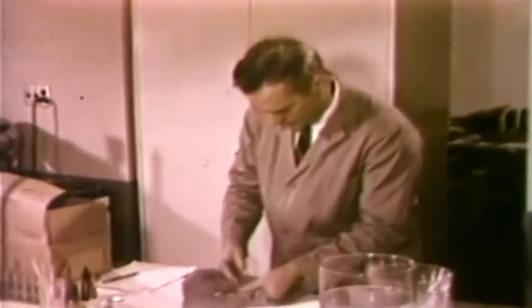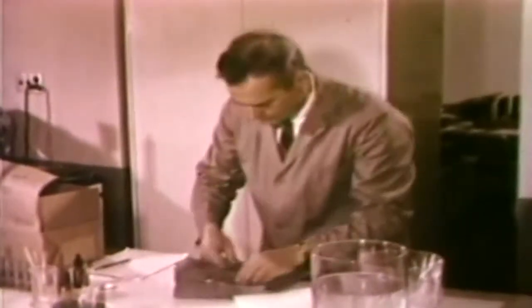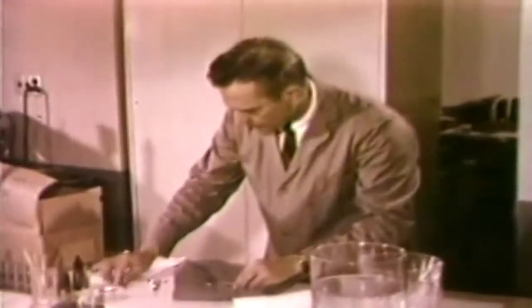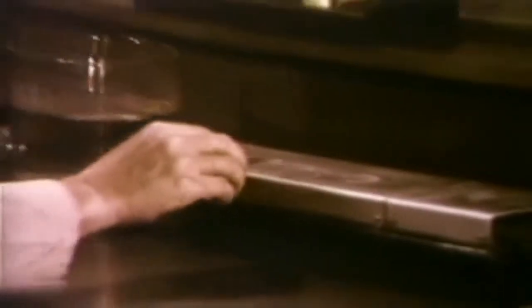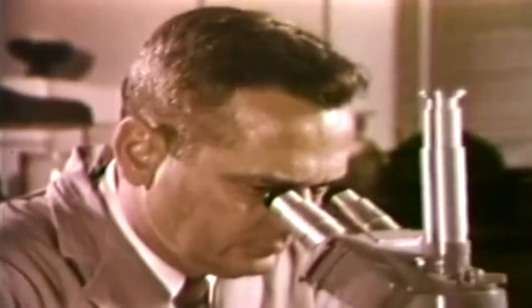To confirm that it is blood, a microchemical test is made for hemoglobin. A small piece is cut from the stained cloth and placed on a microscope slide, which is then covered. A reagent is applied. Then the slide is warmed. When it is placed under the microscope, the examiner can watch the characteristic crystals being formed as the sample cools. These crystals establish the presence of hemoglobin, a positive test for blood.